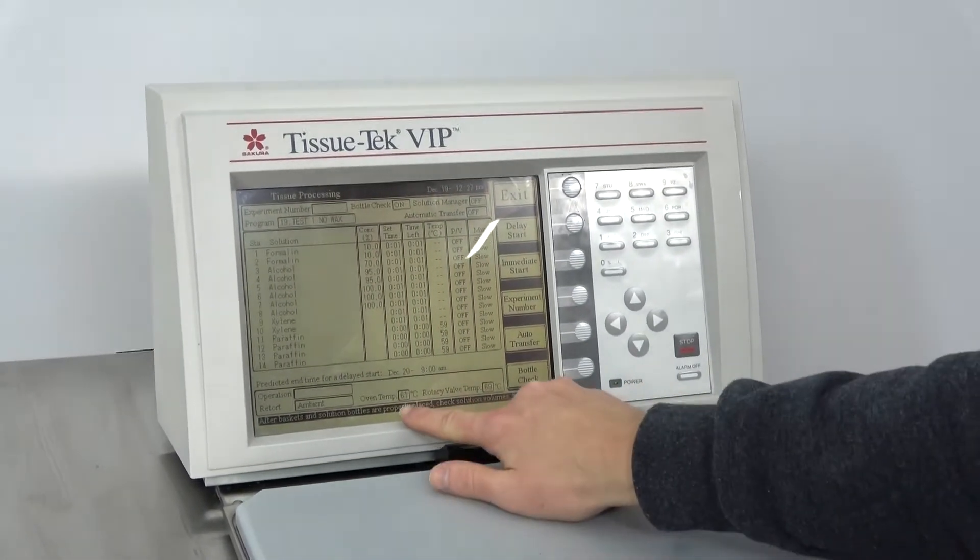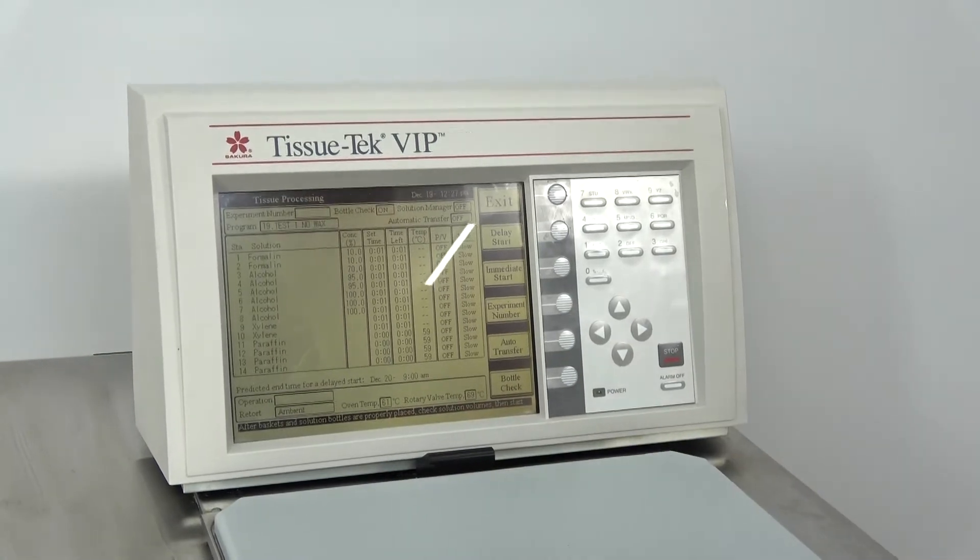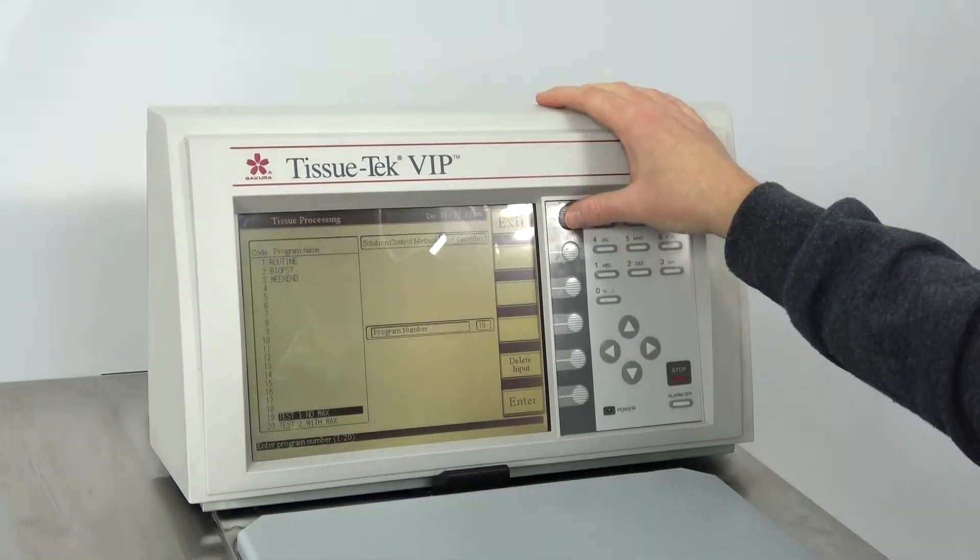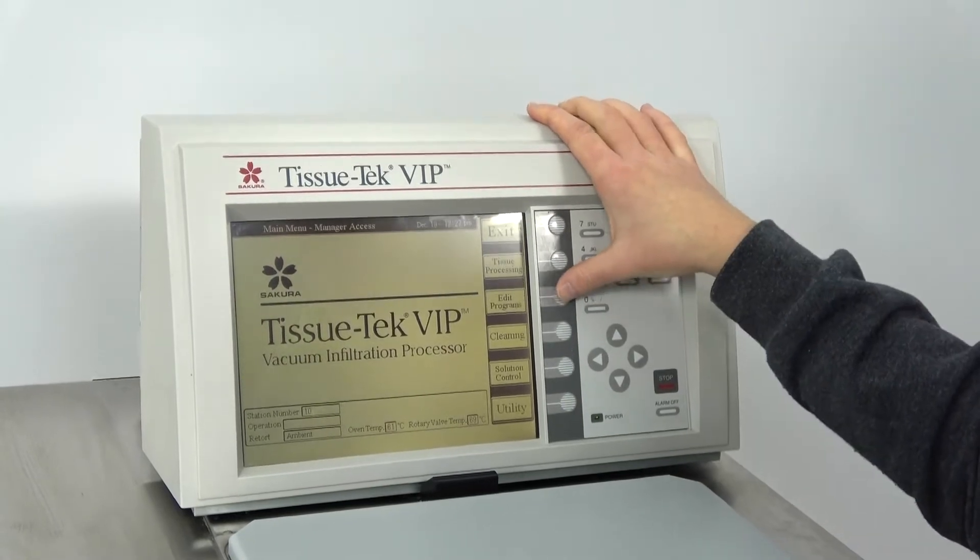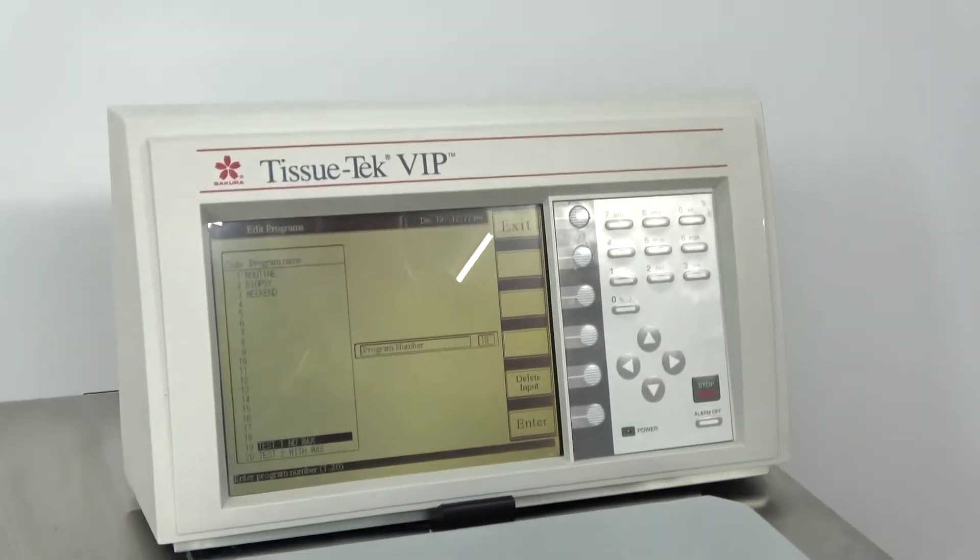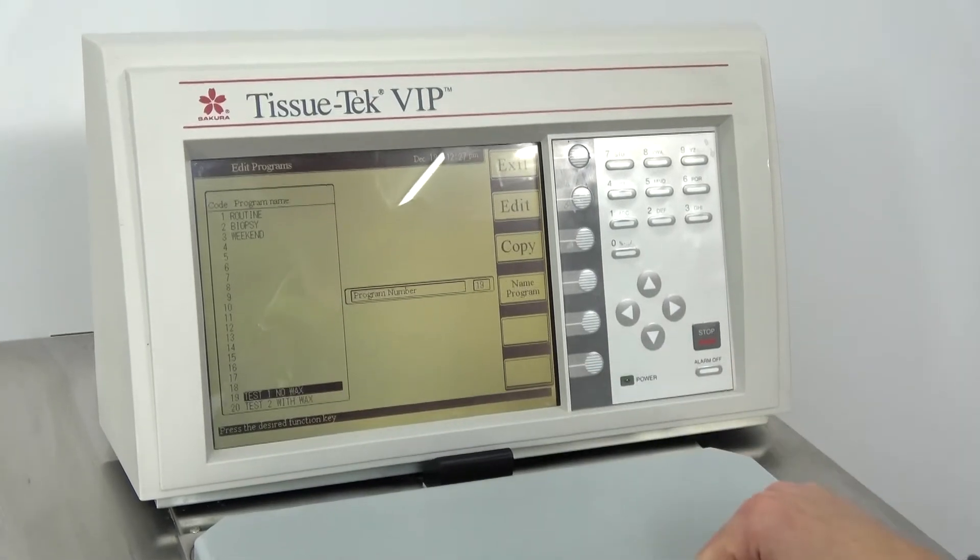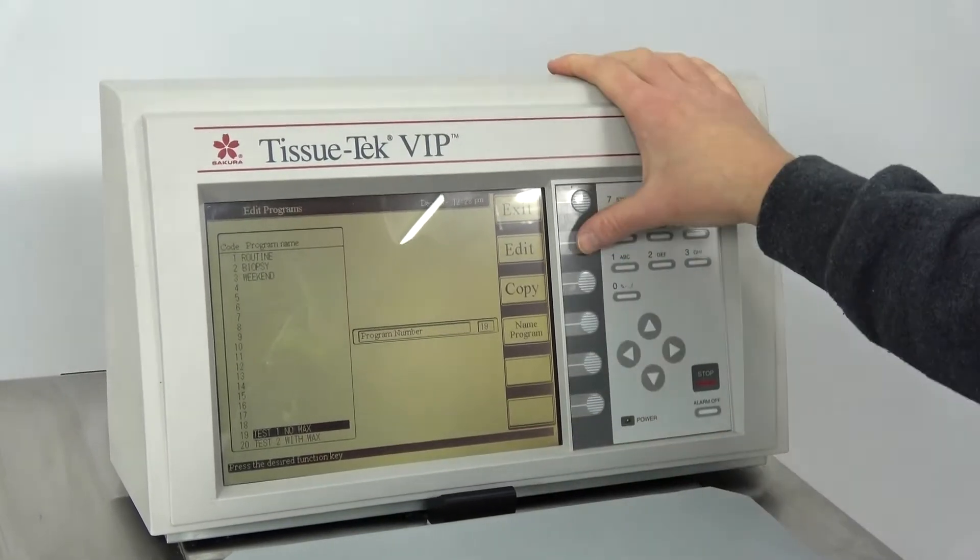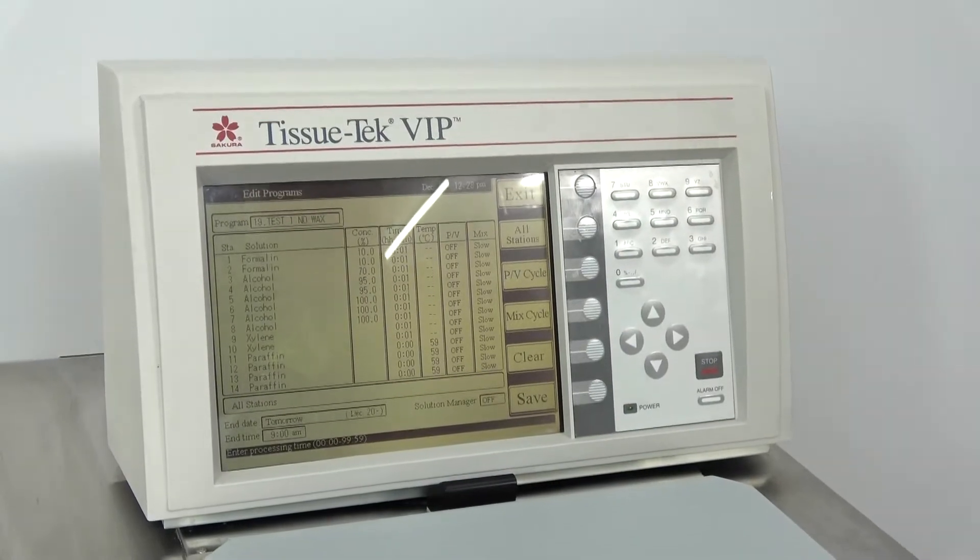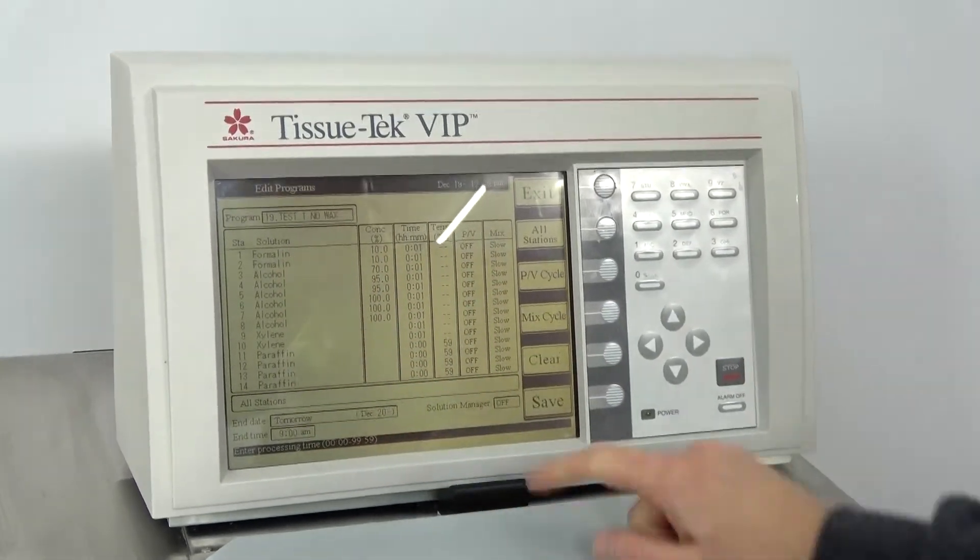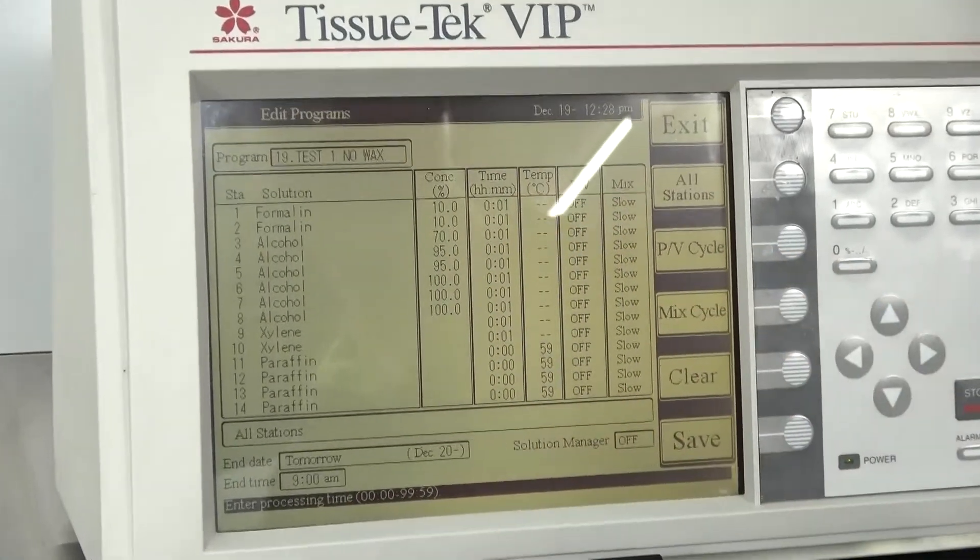This does give you an actual readout of the actual oven temp and the rotary valve temp. So just to give you a quick glimpse too at the programming features of the VIP-5, you can go to the edit programs here and we'll just explore this program. All right program number and we can edit it right here. So you can see each stage of your cycle. You're going to see your concentration, the amount of time for each stage.